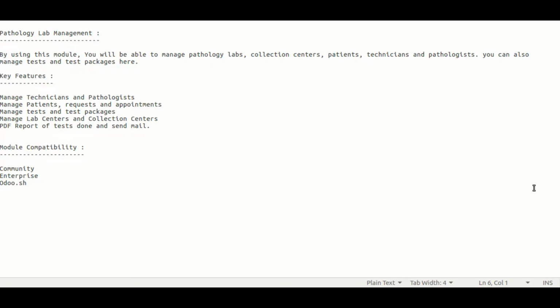Hello guys. Today in this video we will talk about our module which is pathology lab management. By using this module you will be able to manage pathology labs, collection centers, patients, technicians and pathologists. You can also manage test and test packages over here.